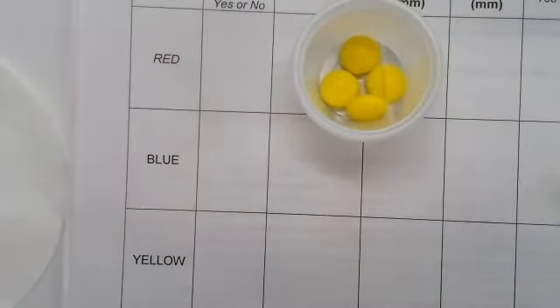All right. The chromatogram paper is over on Caden's desk. And I have one ready. And the directions talked about putting a start line. It said 1 centimeter. I suggest placing that 1.5 centimeters up.